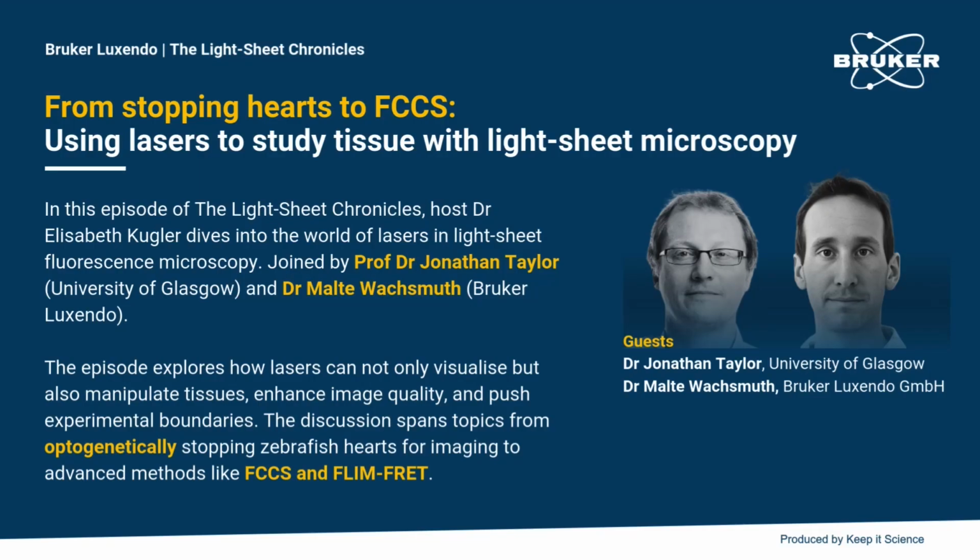Or more generally, you can generate illumination from a variety of different angles so that you have a very similar effect. One way to do this would be to have multiple objective lenses that allow to illuminate the sample under different static angles. Another way would be to do this dynamically.